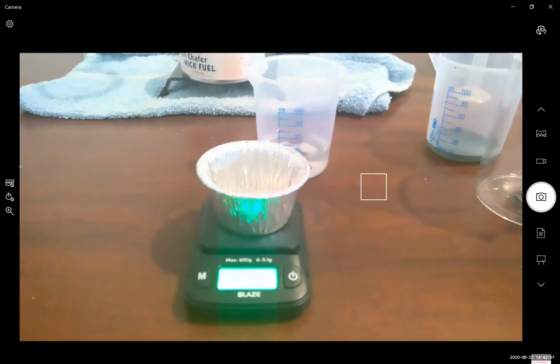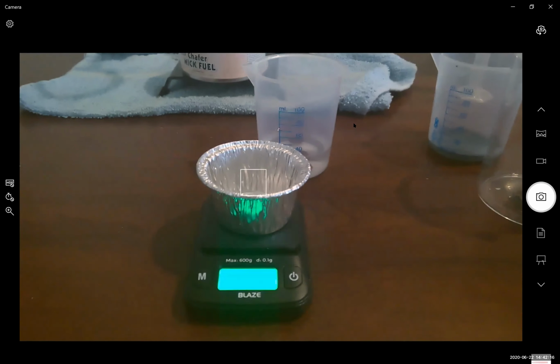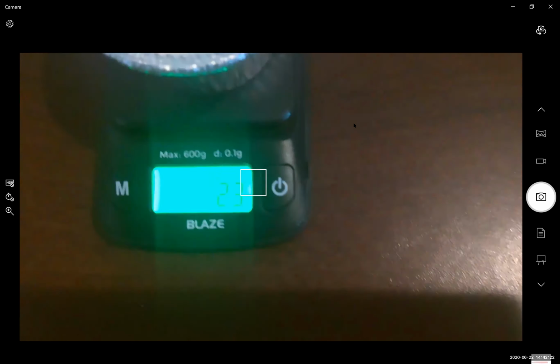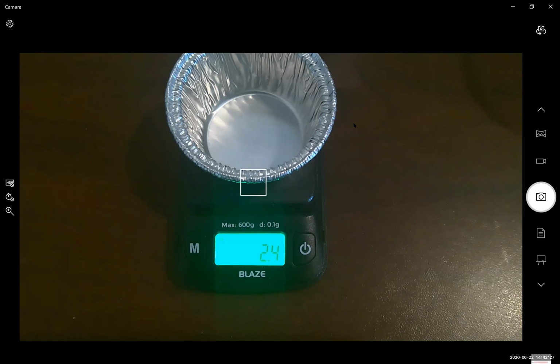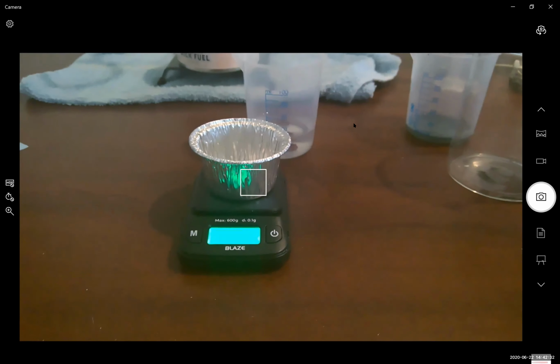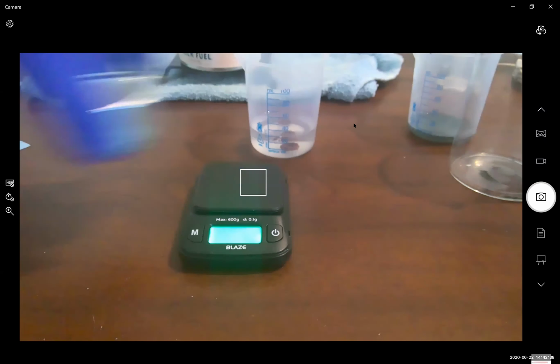Okay, so continuing on with this process, 2.3 grams, or in this case, 2.4 grams after it finally settled down. Okay, so we recorded the mass of our empty aluminum cup. So now we're going to set both of these to the side.